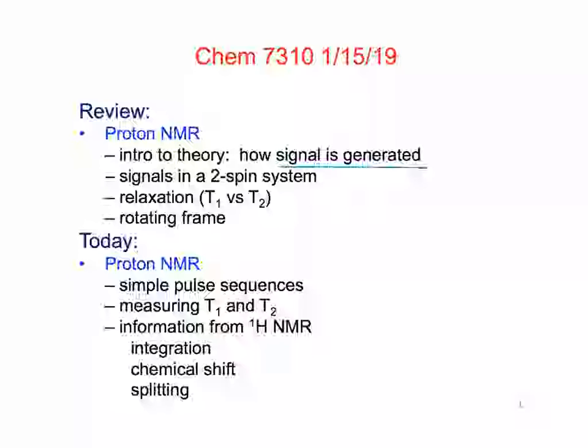And so what we always draw as the signals that we can observe is this vector in the plus z direction, and this is really just what we call the net magnetization. So we've had the plus and the minus, and we canceled out all the ones that are the same, and we just have what's left over.